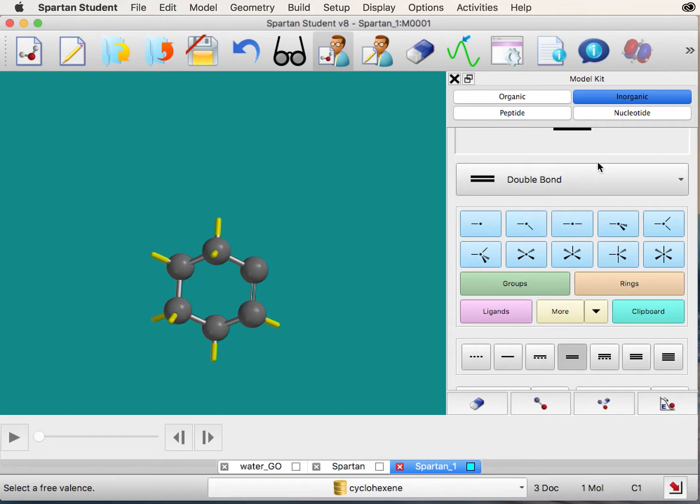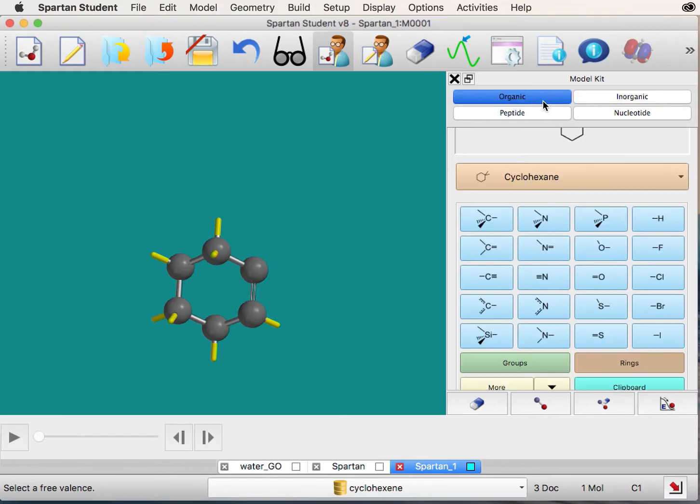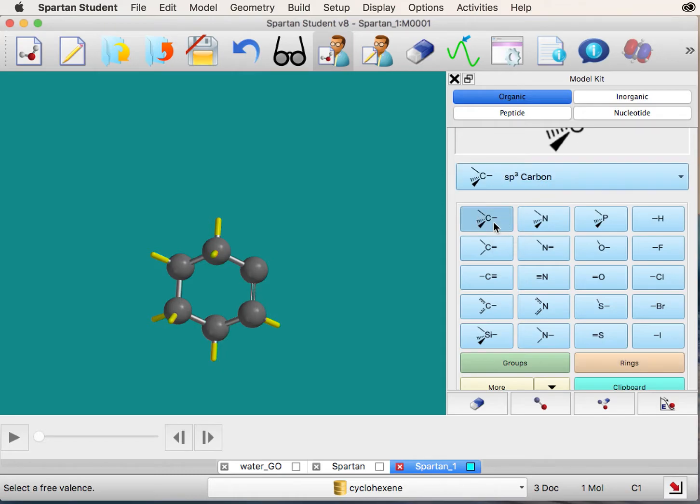Next click the organic tab and select the SP3 hybridized carbon. Double-click to add a carbon adjacent to the double bond.